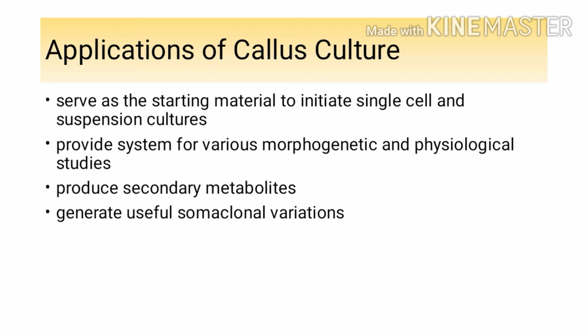So you can trace out the morphological and physiological changes that occur in a single cell extracted from that callus culture.